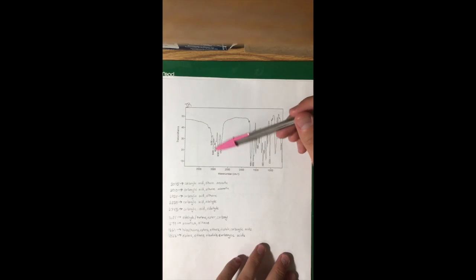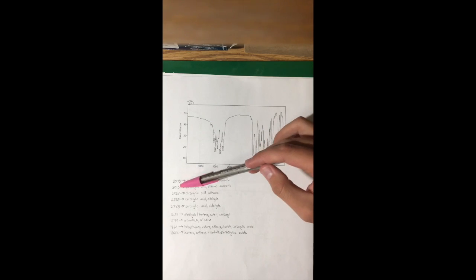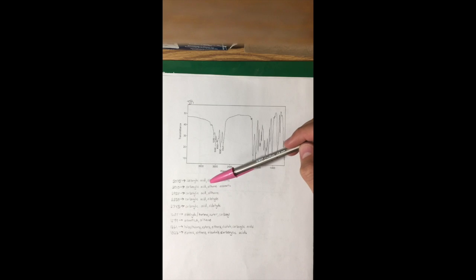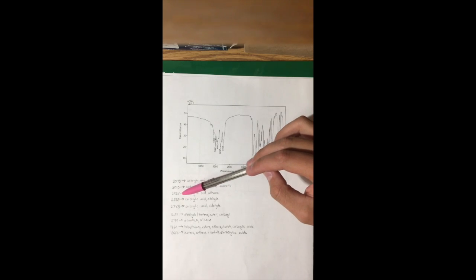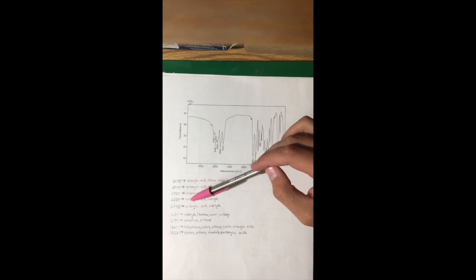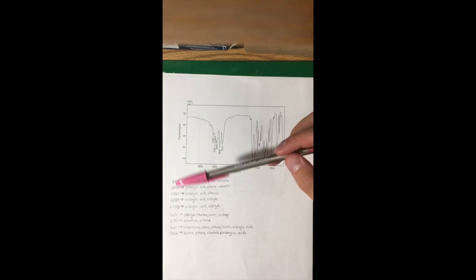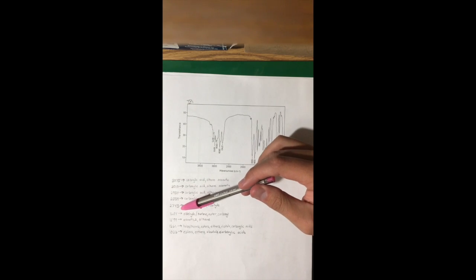Next, we will look into infrared, or IR. Basically we're going to look at all of these different little peaks here with the numbers down at the bottom, and I have them all written out right here. We're just going to work left to right. This first peak was found to be a carboxylic acid or alkene aromatic, along with 3010, the next one. And then the third one, 2934, carboxylic acids and an alkane. 2839, same carboxylic acid and an aldehyde, and again, same with the 2743.